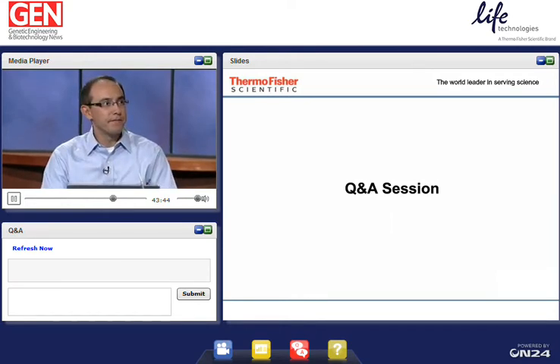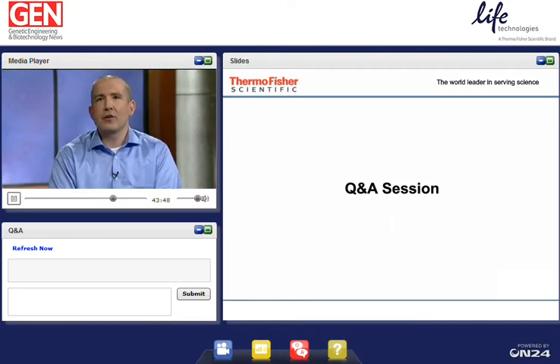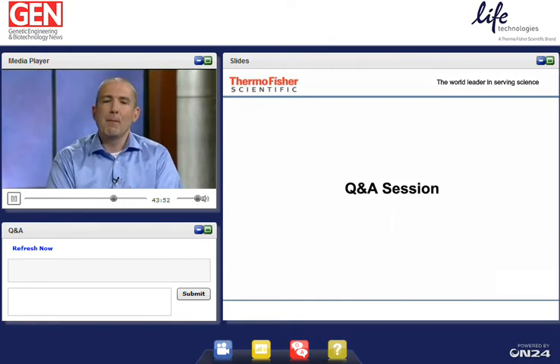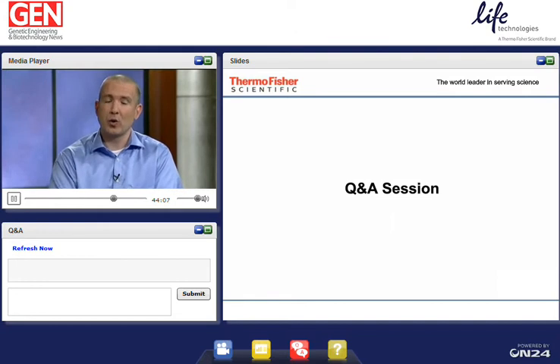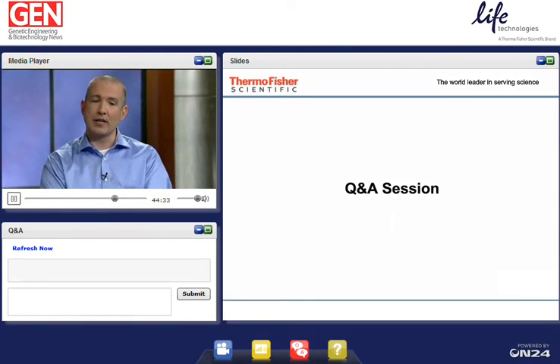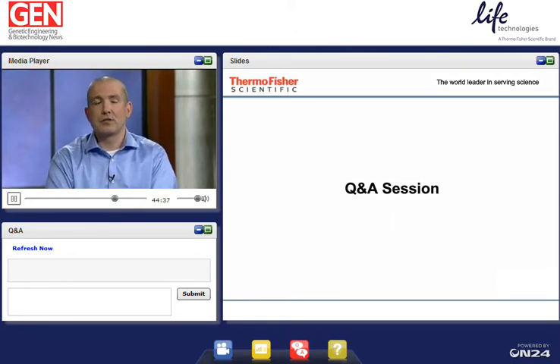I can take that on. Based on the fluidics that we described, there is not a way to dial the speed of flow on and off. But a great way to adjust is the concentration of the antibody. When people say, well, why can't I run it overnight? You can run it overnight, but it's not going to go any slower or faster. But I ask people, why would you run it overnight? Or why would you only run 1 hour? And the answer is usually, well, because of maybe a background issue or not enough signal. That can be adjusted very easily with the concentration of the antibody. What we found is that the flow rate in the card is ideal, the time it takes for that flow. And so, no, it's not something that you can adjust, but we don't think you'll need to. By adjusting the concentration of the antibody and keeping that same flow rate, you should be able to get just as good or better results.